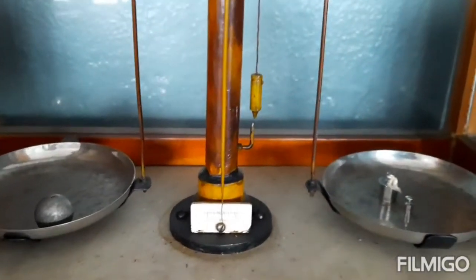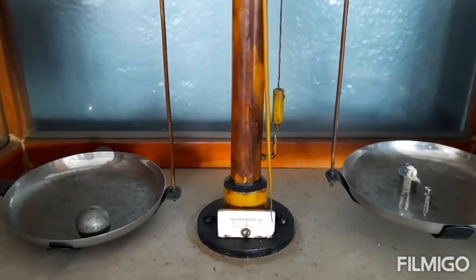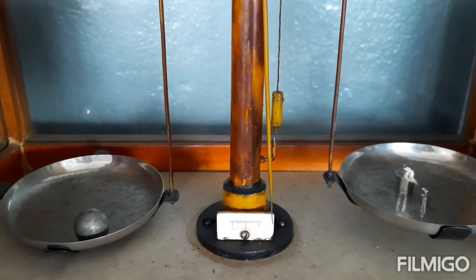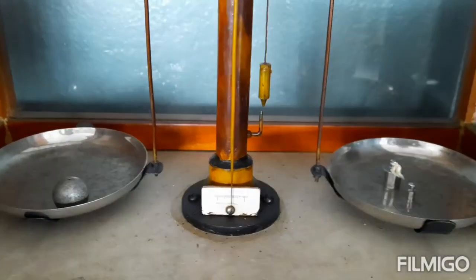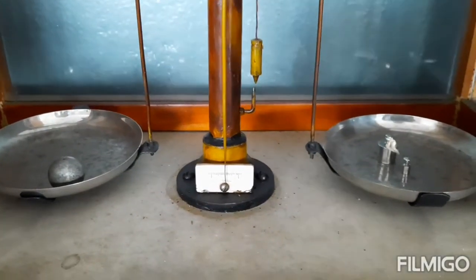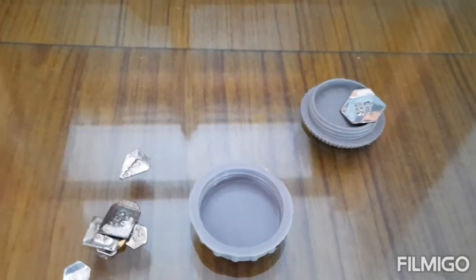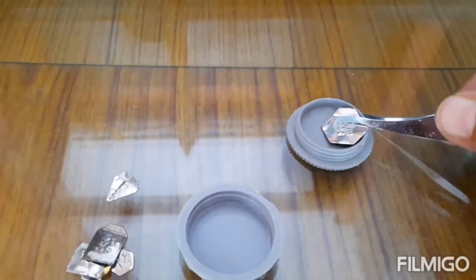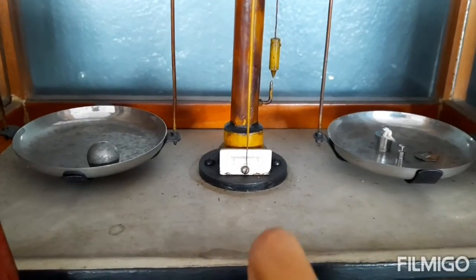So we try with 11 grams — the small weight added is 1 gram. We find that the bob is heavier, meaning it is something more than 11 grams. Now we are going to use milligrams — we will take the 500 milligram weight and weigh.